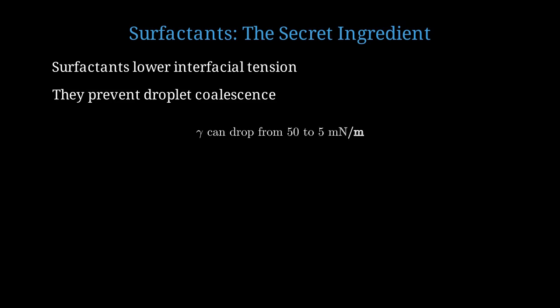Surfactants can reduce interfacial tension from 50 millinewtons per meter down to 5 or even lower. This increases the capillary number by a factor of 10.